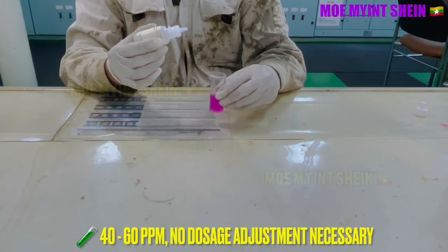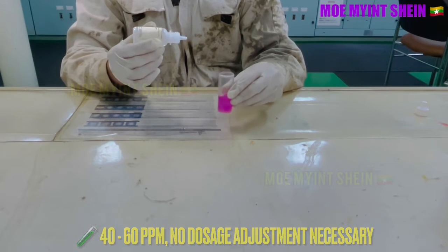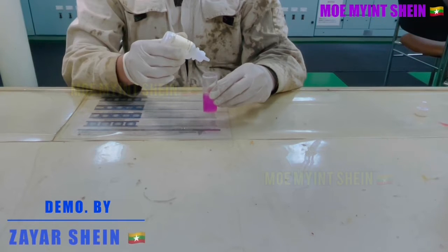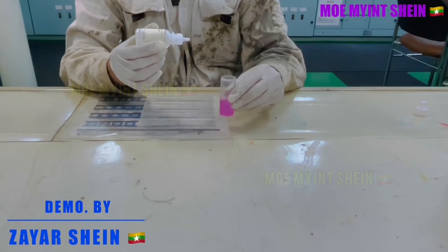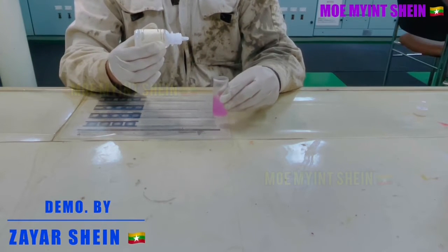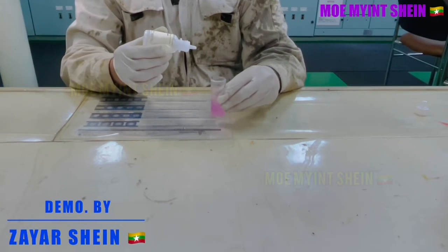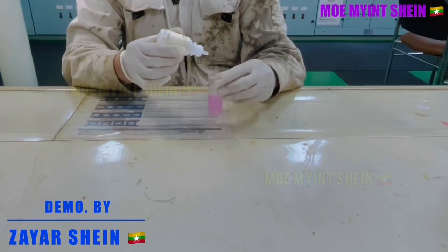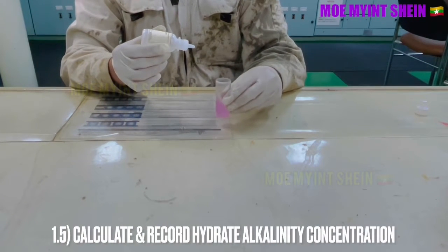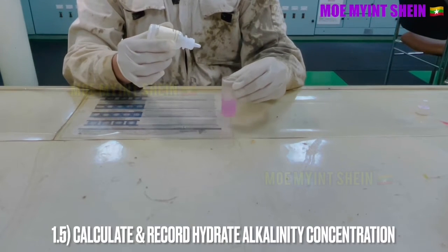If PPM shows 40 to 60 PPM, no dosage adjustment is required. Calculate and record the concentration of hydrate alkalinity into the sheet.